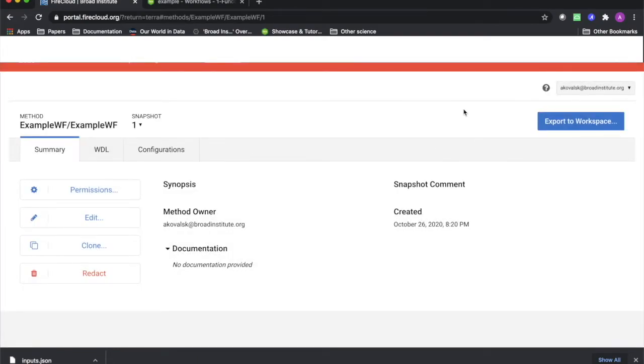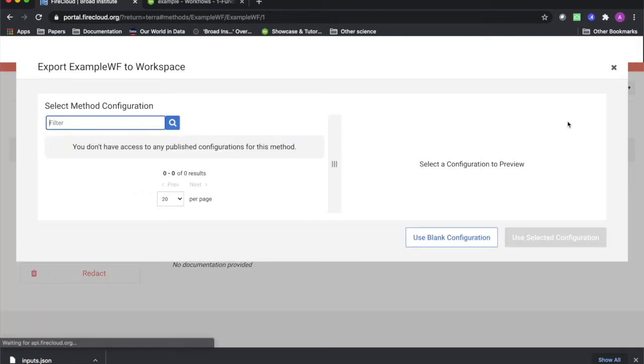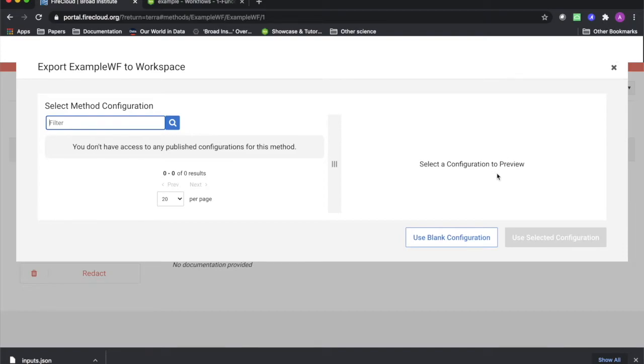Before exporting to your desired workspace, you will see this window prompting you to choose a configuration. As you saw earlier, the configuration refers to the input and output fields specified by a JSON file.